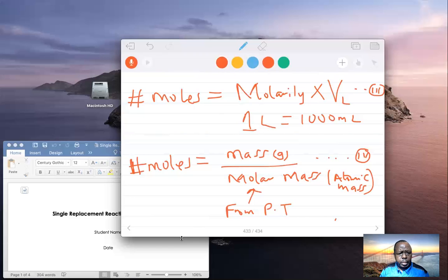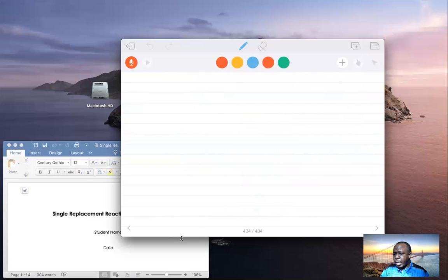When you look at the data sheet, you may wonder, how will I move forward with this? How do I determine the equation? In a single replacement reaction, previously we looked at single replacement reactions in the lab on investigating chemical reactions. And today, the two reagents we will be working with are this aluminum foil you have, and make sure you write it as solid, all right? It's reacting with copper 2 sulfate.